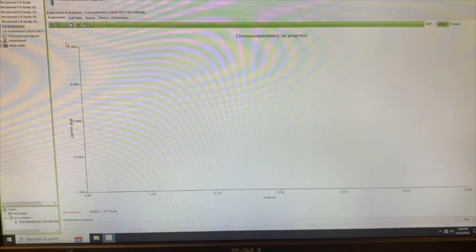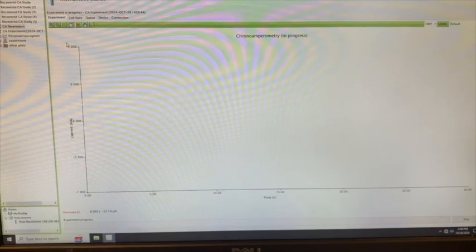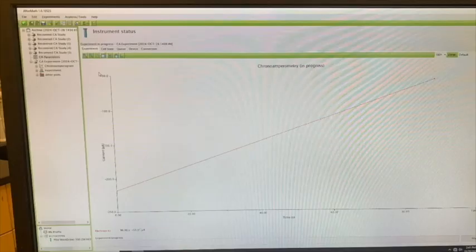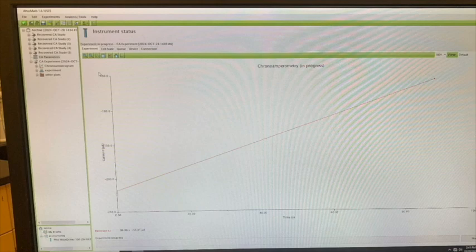You'll see this graph appear. There won't be any data for some time, but just be patient. If you see a red line appear on the chronoamptometry graph that appears once you click perform, you know that the experiment is running. We don't have to pay too close attention to this data. As long as the graph is continuing, you know that the experiment is still underway and there hasn't been a short circuit. Once you see this, you know you're good to go.